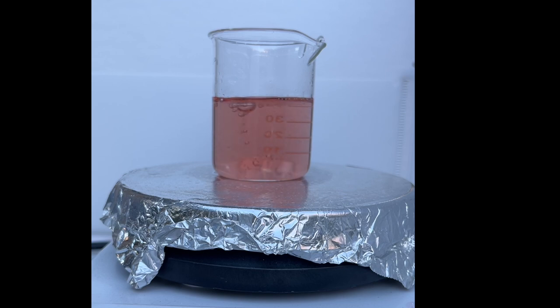Upon the addition of manganese sulfate into the solution, the bromate ion in an acidic environment oxidizes manganese 2 to manganese 3, leading to a color change from colorless to reddish brown. It's worth noting that the literature reports manganese 3 as having a pink color, but this depends on the concentration, environment, and observer.